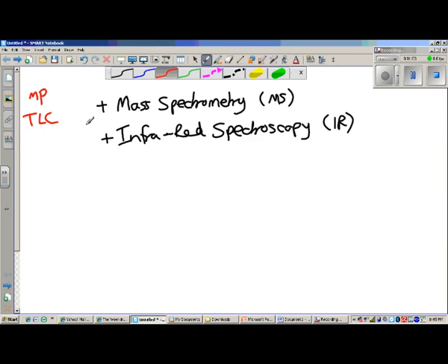And the first two techniques that we're going to look at are those called mass spectrometry. You'll see this sometimes on shows like CSI, where you see the scientist who's always wearing the white lab coat, who uses something called a GCMS. MS here is MS as in mass spectrometry. It's an identification tool. And then the other method that we'll use is infrared spectroscopy. And each of these two does different things, interacts with the sample in a different way.